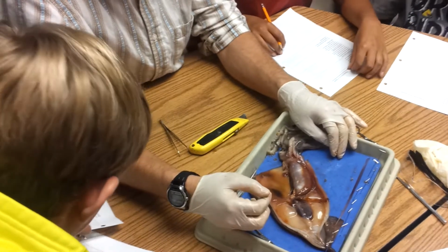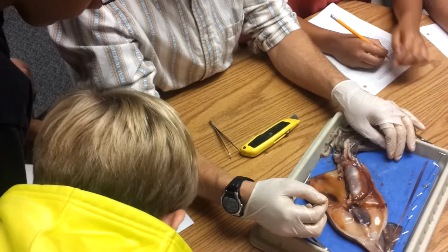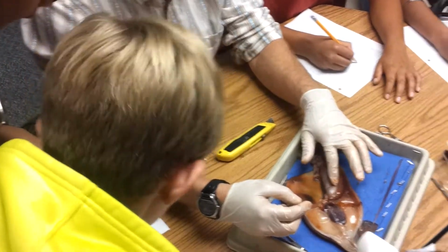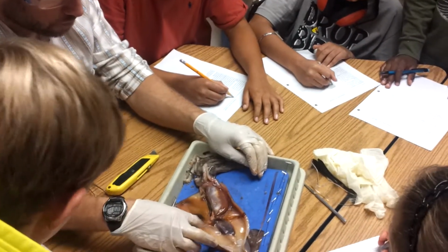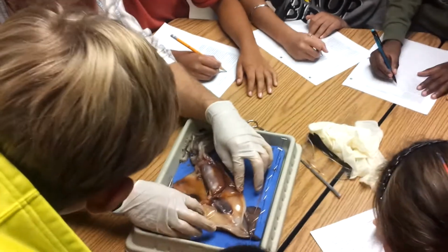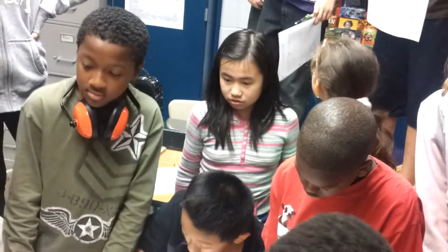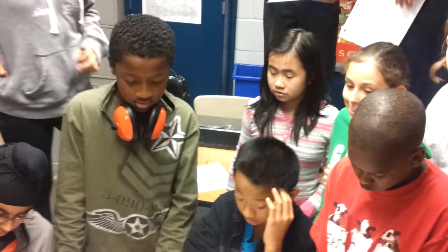Where's the ink pen? It's right there under the liver. It's number 9 because he wants us to see the guts. Oh, look at all that air inside of it. It's popping. No, it's blood. So the bubble-looking thing, we'll go over in a minute. I think it's a boy. Now, you should be drawing a picture of what's in the middle. Now, let me tell you what you're seeing.